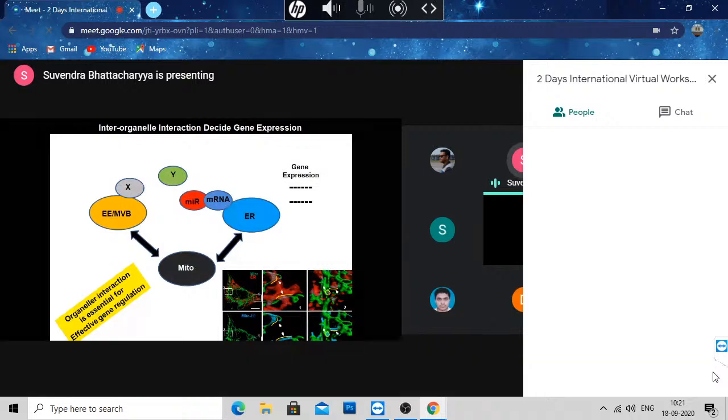You can acquire a 3D image reconstruction by scanning different planes, and over time also, in a 4D imaging with different wavelengths too. You can image all these together in the confocal microscope and deconvolute the image.